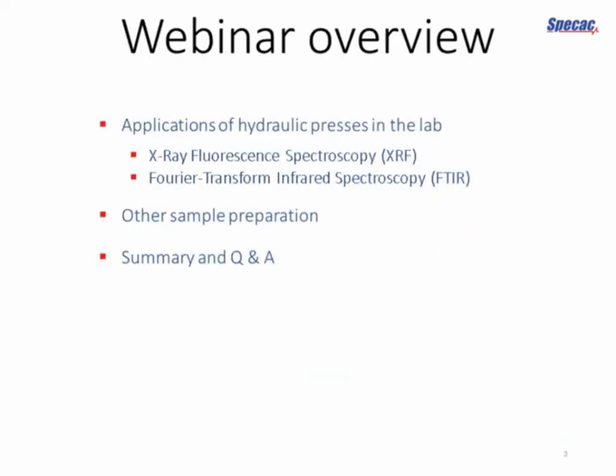Well, welcome everybody. As Sarah has already ably pointed out, we're going to look at a few applications of hydraulic presses in the laboratory today via a couple of different analytical techniques. The first is X-ray fluorescence spectroscopy, or XRF. The second is Fourier transform infrared spectroscopy, or FTIR. And we'll also look at a couple of other uses of hydraulic presses in the laboratory that aren't necessarily to do with spectroscopy, but perhaps more engineering-based. And at the end, there'll be a short summary and a time for questions.